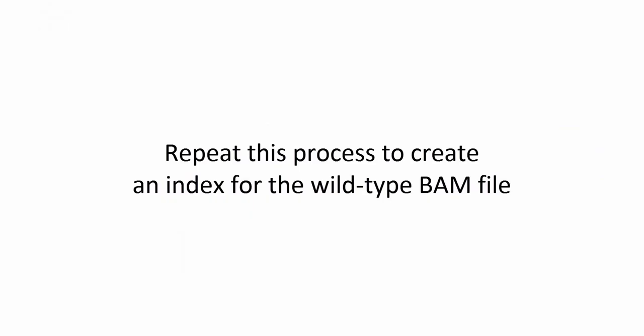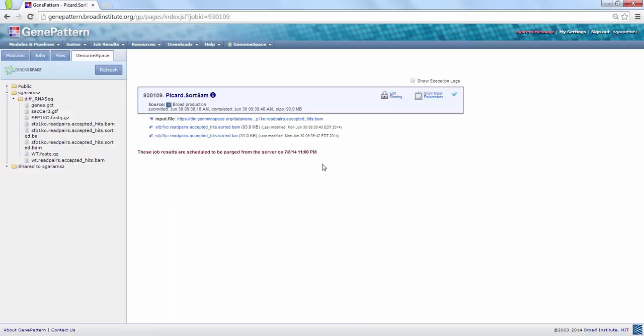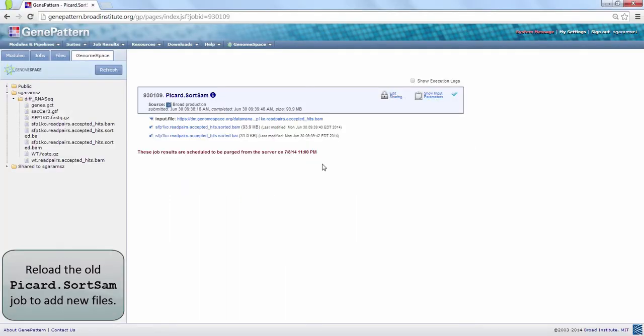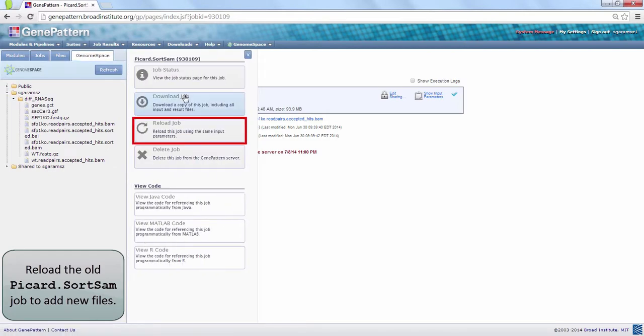Next, we will submit another Picard Sort Sam job to index our wildtype BAM files. To reuse a previous job as a template for a new one, click on the job and then choose Reload Job.